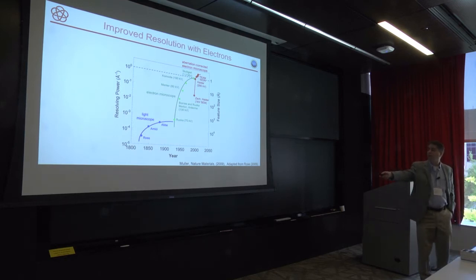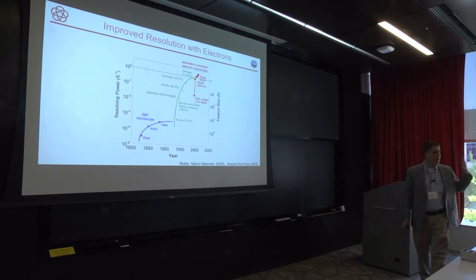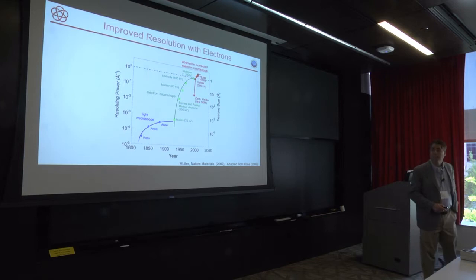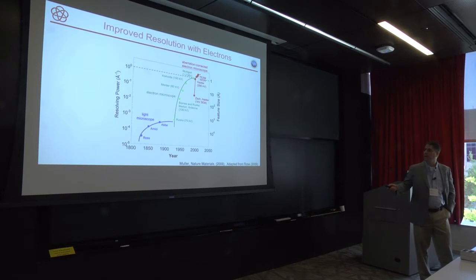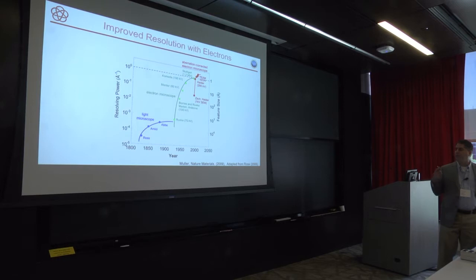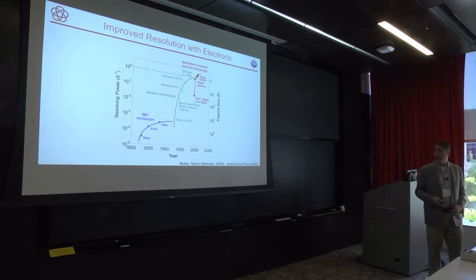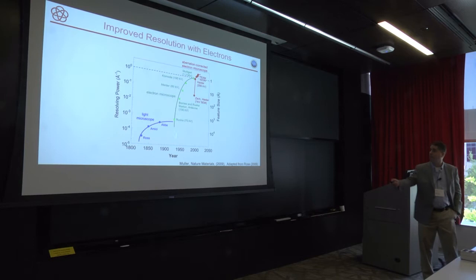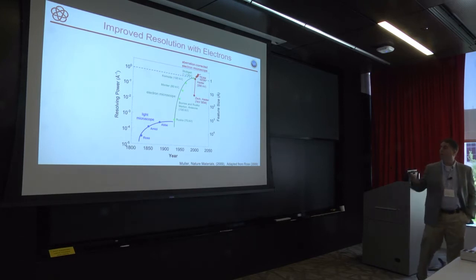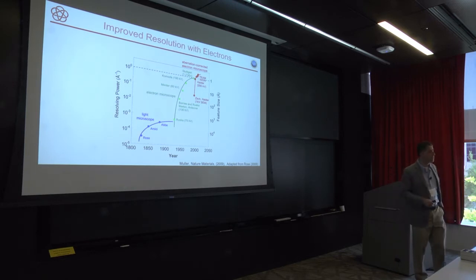over there, and the main point was light microscopy had run out of steam by the turn of the 1900s. And a diffraction limited light microscope today looks pretty much like what a light microscope would look like in 1900, except it's more user-friendly. And there are, of course, a lot of super resolution methods today that make light microscopy a lot more interesting, down to maybe about that level over there. But if you ask yourself, how do I know what a virus looks like? And the polio virus in particular, the answer is because of electron microscopes.